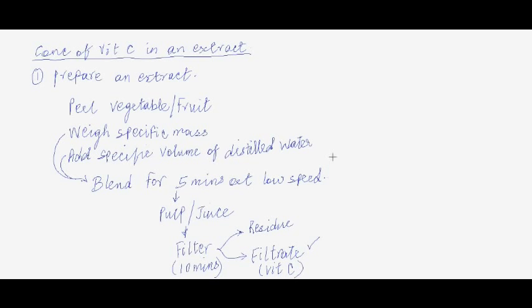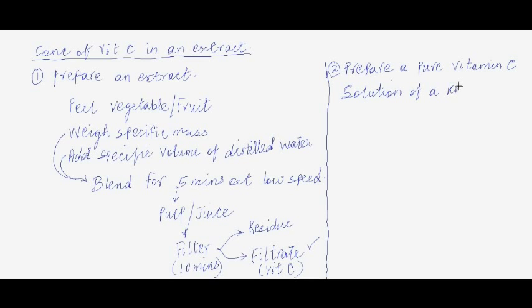Now once we've done this, the second step would be to prepare a pure vitamin C solution of a known concentration.